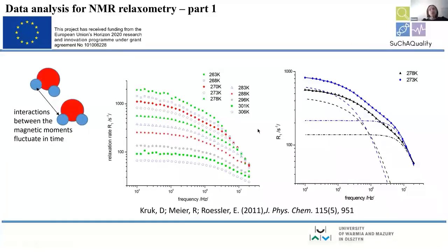Okay. Here you have typical examples of relaxation data, of relaxometry data, for very simple systems like propylene glycol or glycerol. And here you see on the x-axis you have frequency in hertz. It's just the resonance frequency. So if one prefers, but in our community one does not do so, one could also plot here the magnetic field. And actually for protons, there is a well-known relationship. It's worth remembering that 42 megahertz corresponds to a magnetic field of about 1 Tesla.